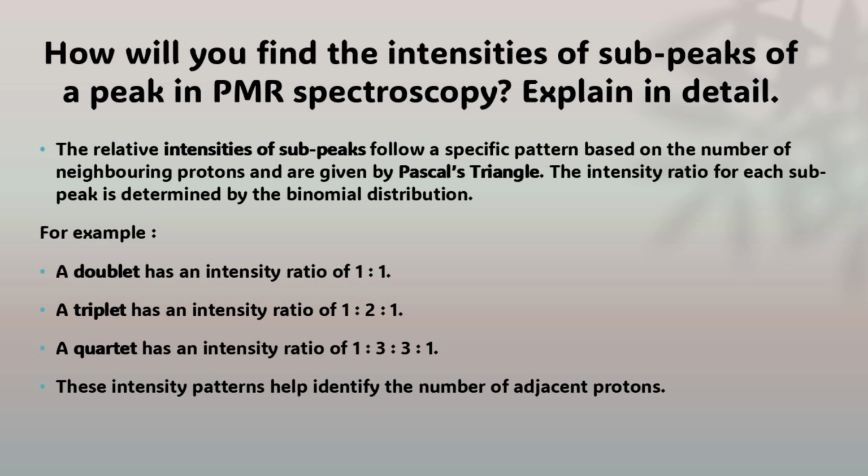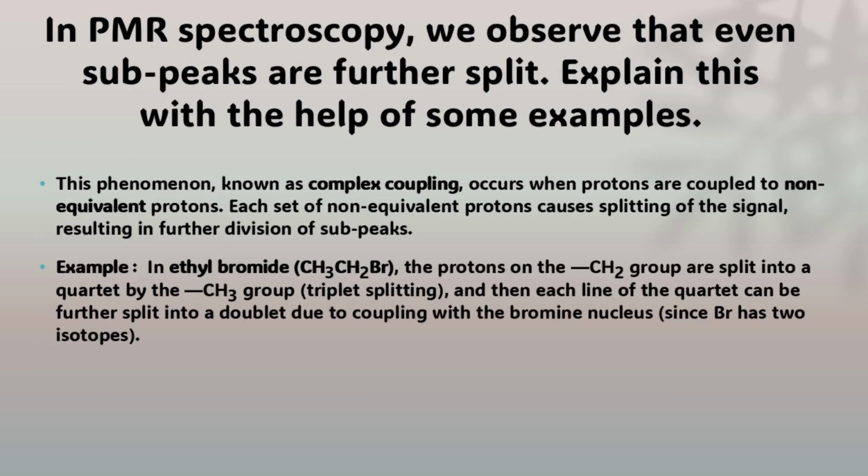These intensity patterns help identify the number of adjacent protons. The next question is question number 57. In PMR spectroscopy, we observe that even subpeaks are further split. Explain this with the help of some examples.